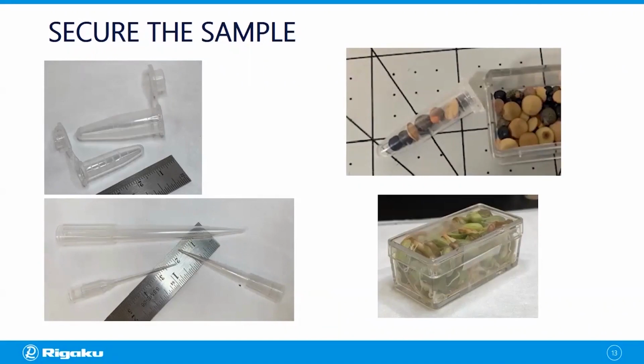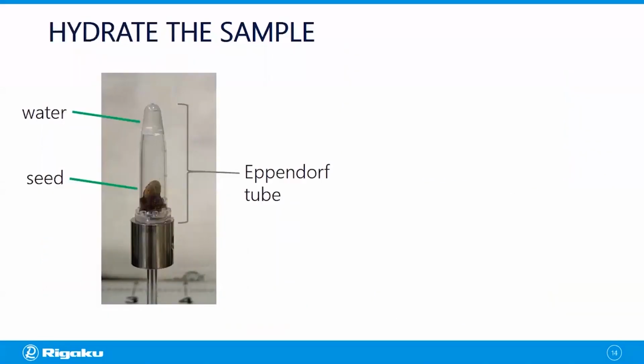When using any new material, a good first experiment is to collect data on the container or adhesive material alone, or with a small plant sample, to evaluate its X-ray transparency. Keep in mind that our plant samples contain light elements like carbon, nitrogen, and oxygen. However, some adhesives or materials could contain heavier elements. So the goal of this preliminary experiment is to identify X-ray transparent sample holders. And in some cases, you may be able to create your own impromptu sealed sample environment.